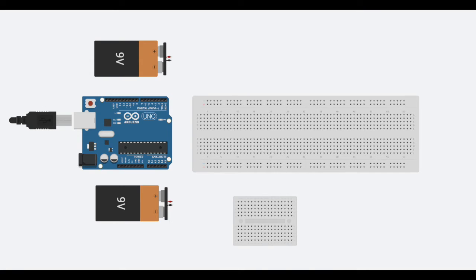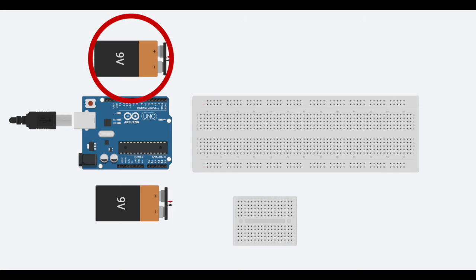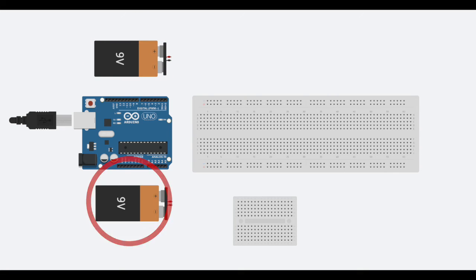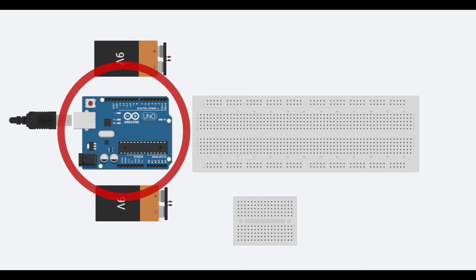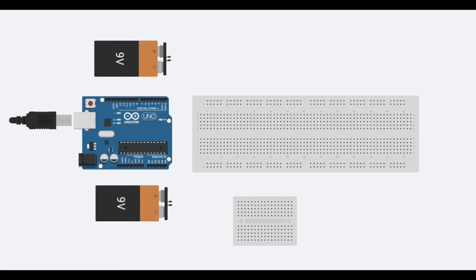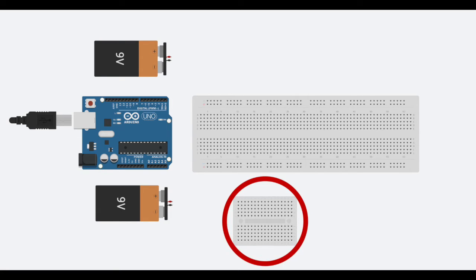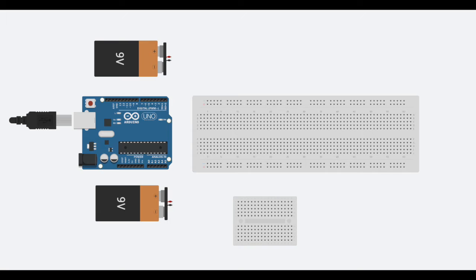We can now familiarize ourselves with the different components that are used to assemble our potentiostat. First, we need our external power supplies, which are used by these two 9-volt batteries here. For our experiment, we will only be needing 5 volts. Next, we have the Arduino Uno microcontroller, which will take any applied values from our computer and to our breadboard. Finally, we have an additional breadboard, which will serve as our common ground.